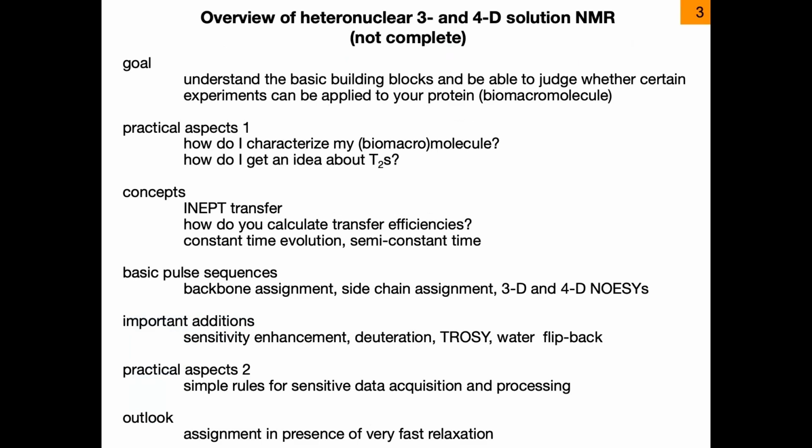The first thing is that you know your system that you are working on. How do you characterize your biomacromolecule? This will boil down to actually getting an idea in solution NMR about the transverse relaxation times. That's the most important parameter. And then I will introduce you to the concepts used in the pulse sequence.